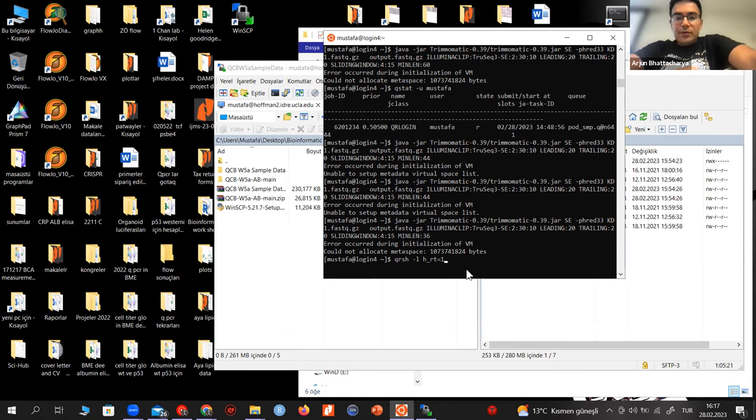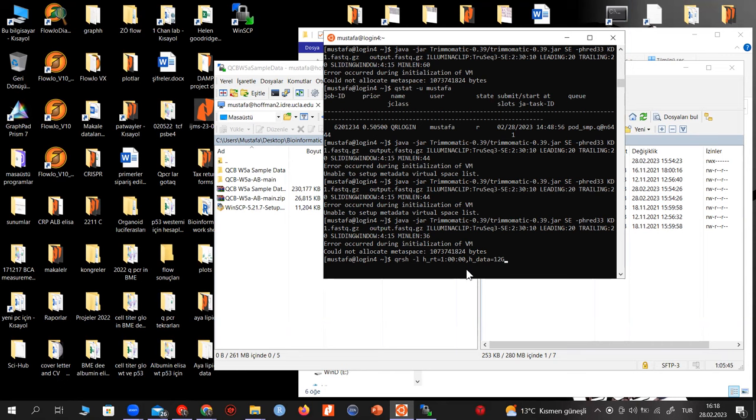Equals 1:00:00, comma, h_data equals 12G. And now press enter.